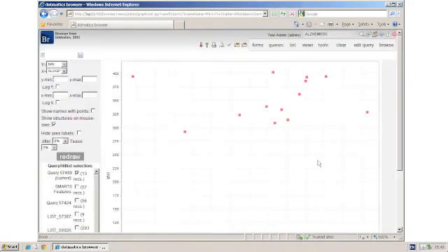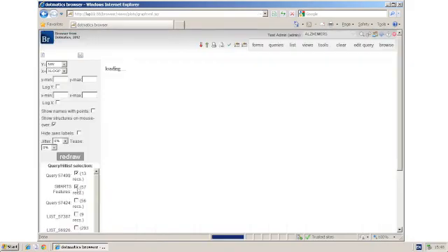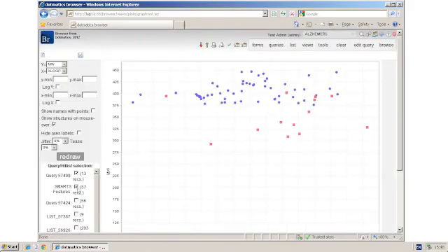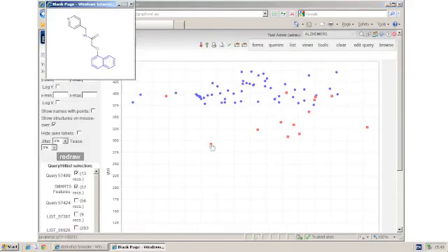Here's a scatter plot. In this view, I can see multiple lists at the same time with mouse overs to show me the structures.